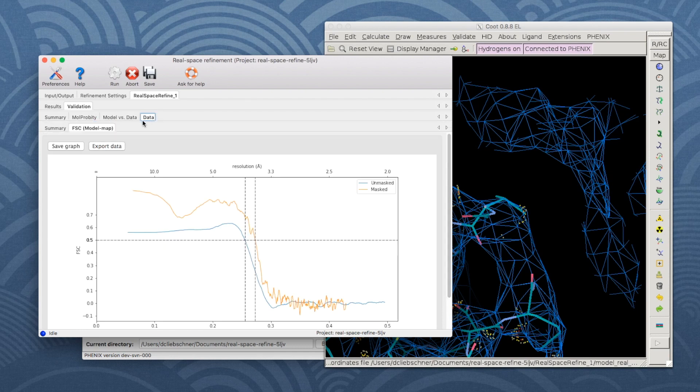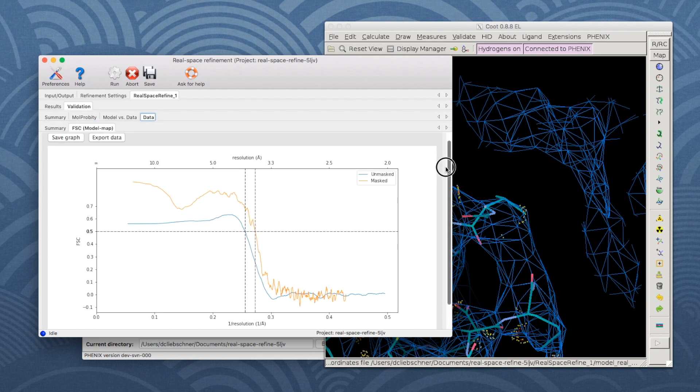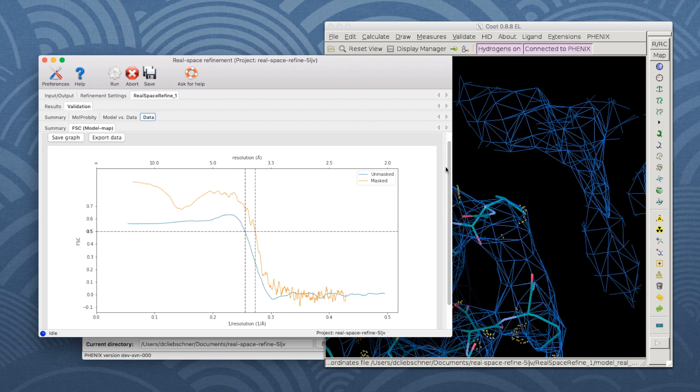The Data tab gives reports on the input data, such as Fourier shell correlation plots.